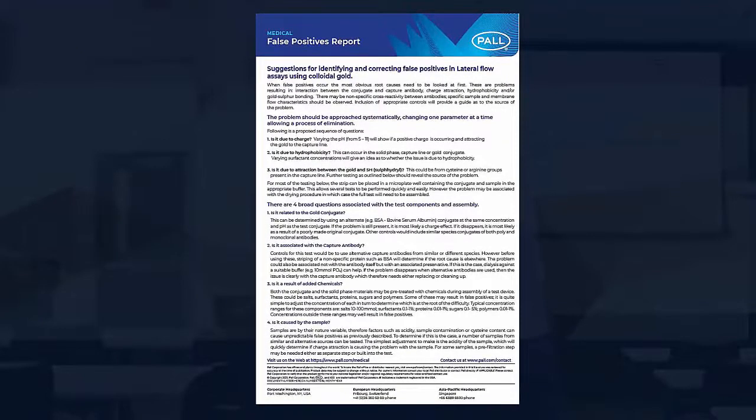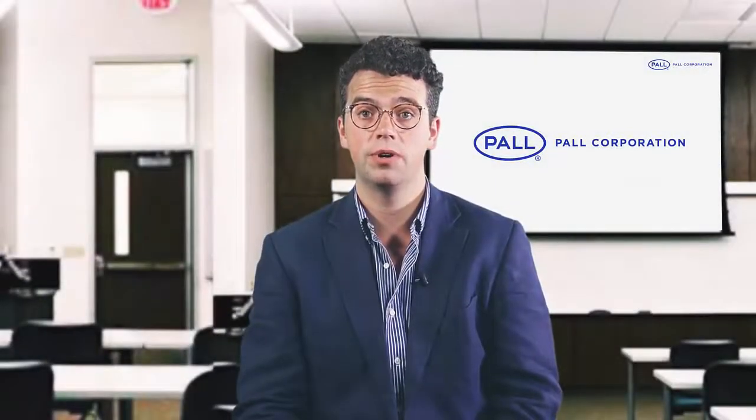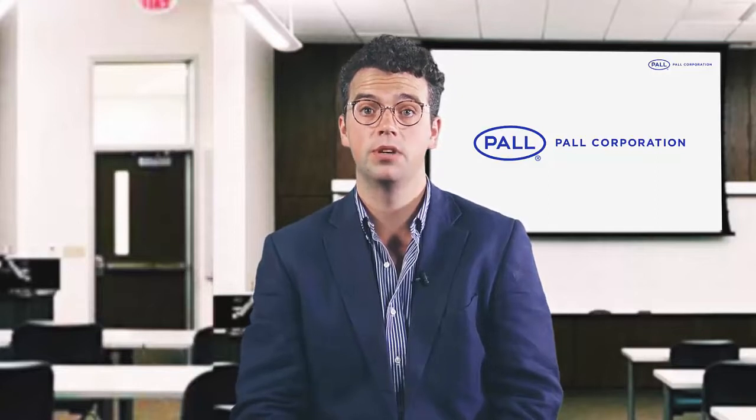A false positive is created by interactions which are not expected and results in test line variances. In other words, direct or indirect interactions between capture antibodies and detection antibodies are the ultimate root cause. To identify the driver for this issue, setting appropriate controls is of extreme importance. Without a control, it is quite challenging to figure out the mechanisms driving a false positive because multiple parameters have an influence on the assay.